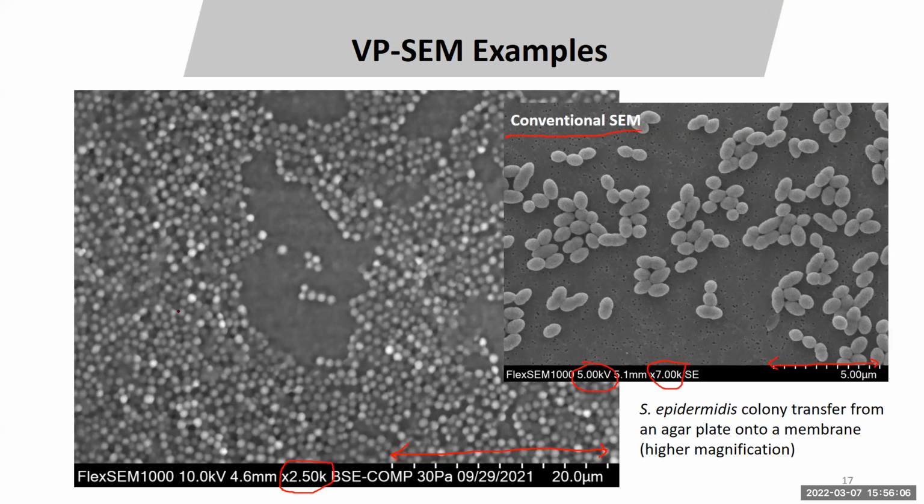Hi, Yong Hwee. This is Harris. Thank you so much for the very nice presentation. I have a question. Let's say you have a tissue sample that has already been PFA fixed. Would that work? It should work, because the PFA doesn't really affect any part of the sample other than trying to keep it intact.